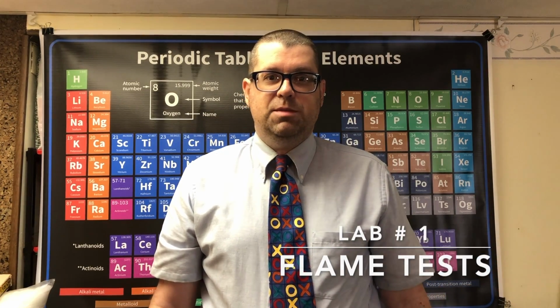And welcome everybody. Today our first lab is going to be all about flame tests, and flame tests take advantage of a property studied by Niels Bohr back in the early 1900s, in which he used experimental evidence to figure out where exactly the electrons are in the atom. Rutherford's model prior to that had no explanation about where the electrons are, but Bohr said, I can figure it out using some experimentation. And in this experimentation, he discovered that if you energize electrons the right way, it undergoes what's called absorption.